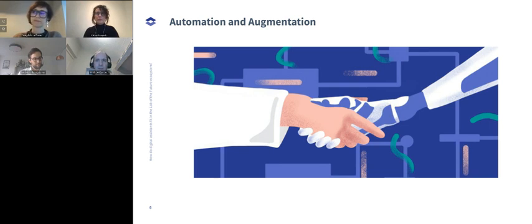And I think this is the sort of assistance that we're talking about. We've talked about the voice assistant playing a part in that, in helping guide that information. And so it can either be done by a human or by an automated system that sort of walks you around the steps. So, for example, you can replace an HPLC column without having prior experience, because overlaid onto your vision is a diagram of the equipment and which bit to plug in where. It's like the ultimate Lego guide for using it. So, we're seeing smart glasses getting some interest there. And I think in the future, we'll see them really taking off.